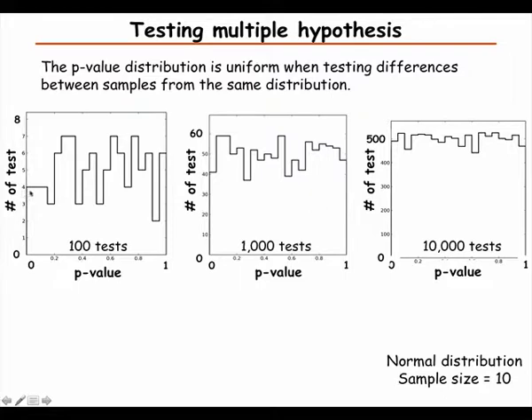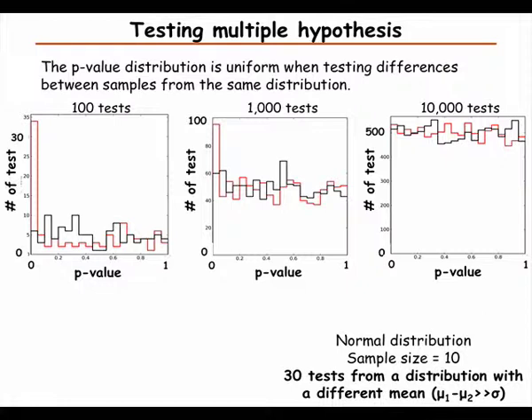Our significance test here is on the first bin. Usually, we select any p-value that's less than 5%. So if we have done 100 tests, we're going to have, in this case, 4. In this case, 42 maybe, and in the case of 10,000 tests, almost 500 that have a significant p-value if we wouldn't correct. So that's another way to look at why we need multiple testing correction, because that's the bin that would be considered significant if we have a 5% significance value.